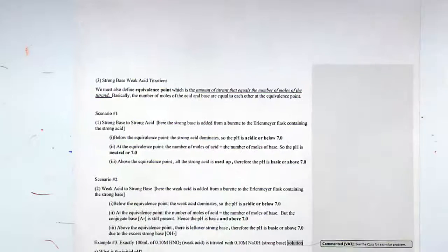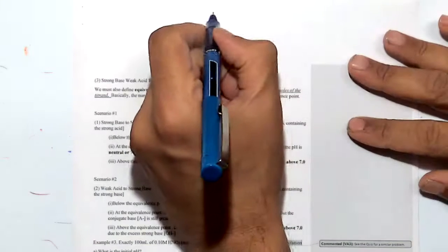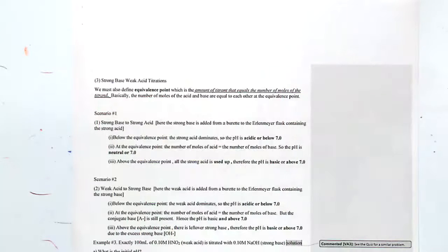These are the problems that you'll do on Friday. They can be a little tricky. All right, so let's figure out how to navigate this properly. The first thing here is the titration setup is right here. You have a long piece of glassware, and I know I'm going to spill, and God forbid I may break the glassware. This long piece of glassware is called a burette. So it has a little thing there. You can turn it on and then turn it off.